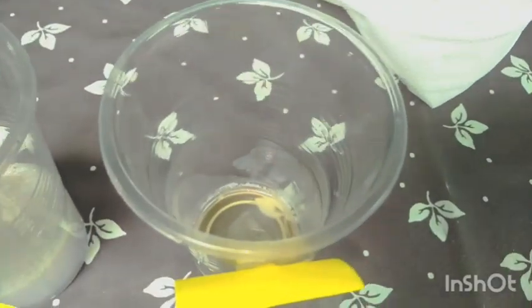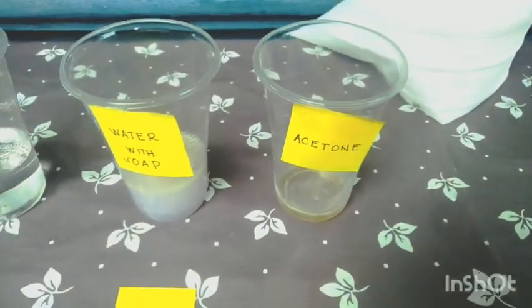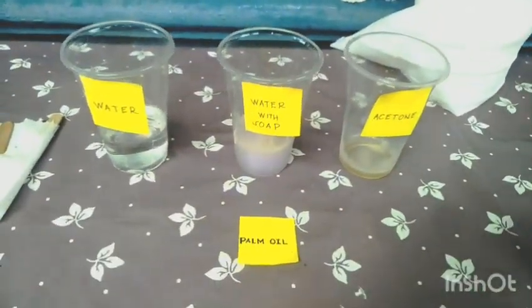As you have observed, the palm oil is also the same as the coconut oil and pork oil. It is insoluble in water and water with soap, while it is soluble in acetone.